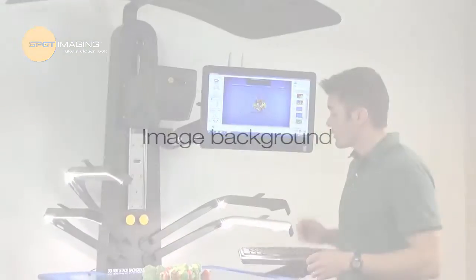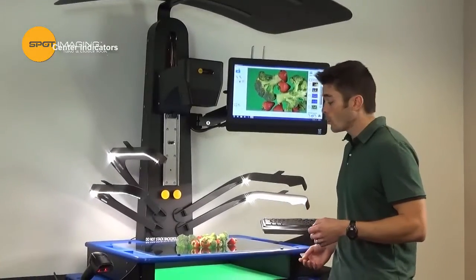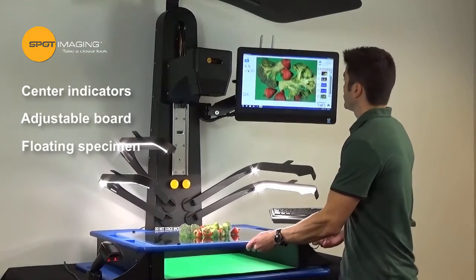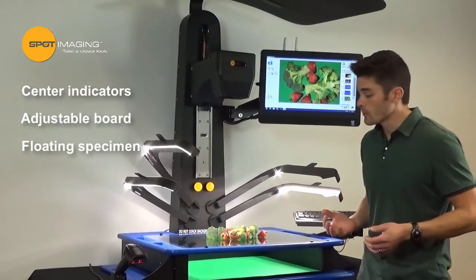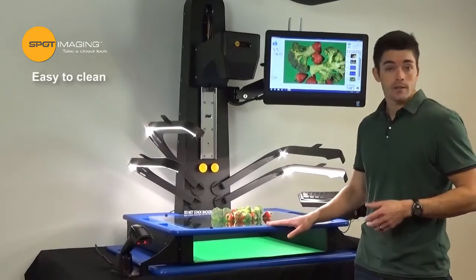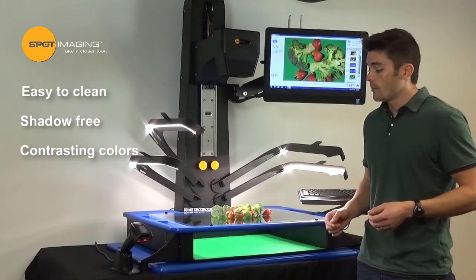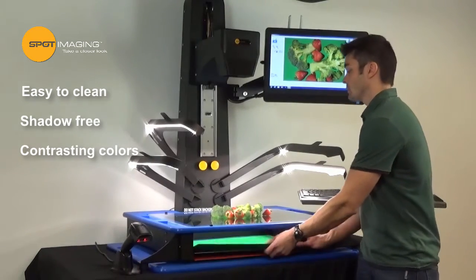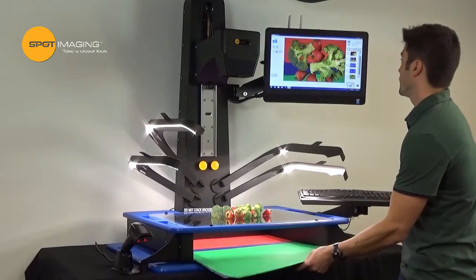To assist with positioning of the specimen, we've added center indicators on all of our background boards as well as made them adjustable. Another new feature with this stand is the floating specimen feature, which utilizes a glass plate instead of a solid board to eliminate the shadow effect. To optimize this feature we've added easily interchangeable different color backgrounds to get different color effects.